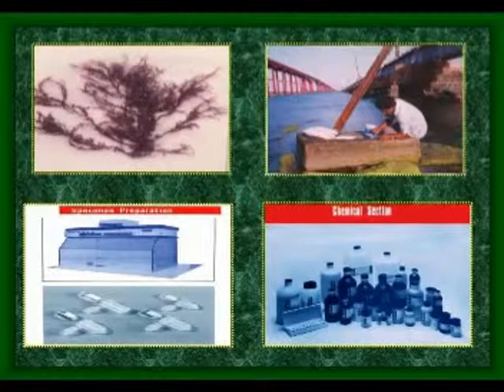Fixation is the preservation of structural and cellular elements in detail. Fixation is the frozen slice of life. Fixation should make a permanent and as true a picture of cell structure as is possible. So these are the objectives of the fixatives. Suppose you are fixing the material; while you fix the material, it is in a frozen state.